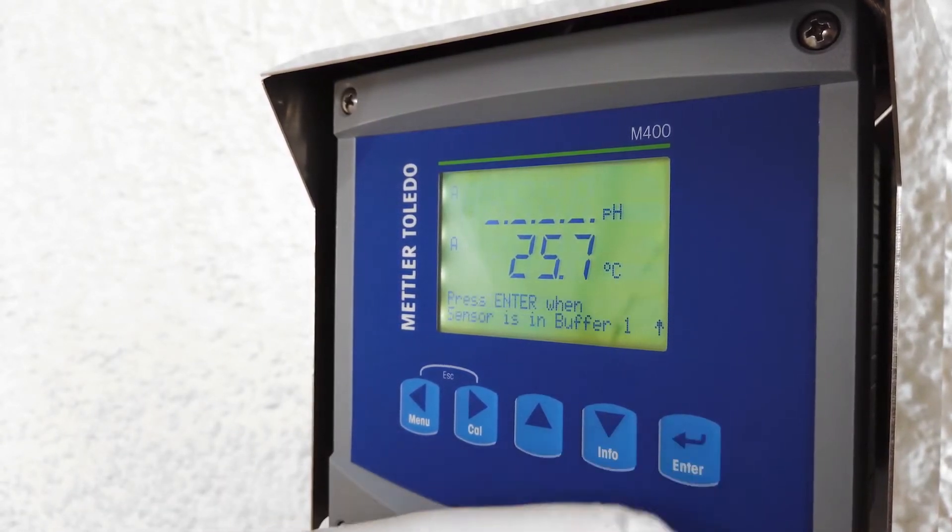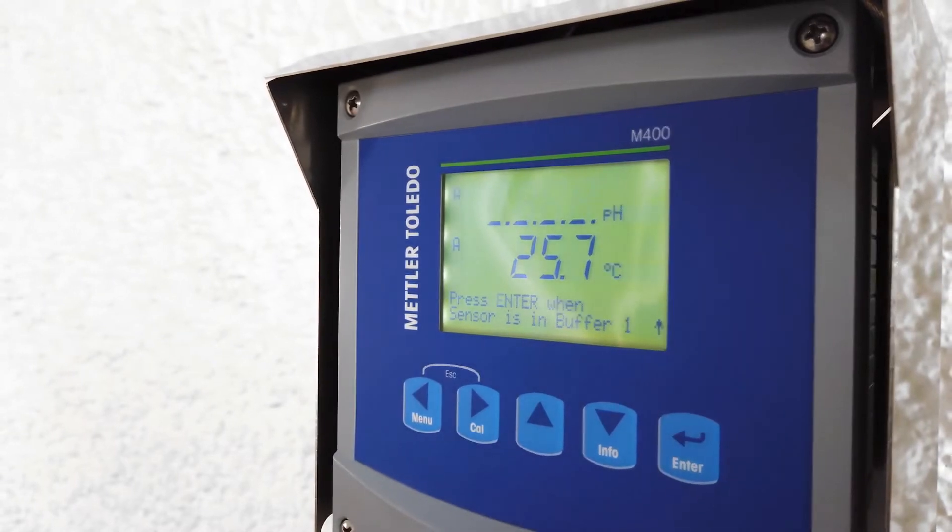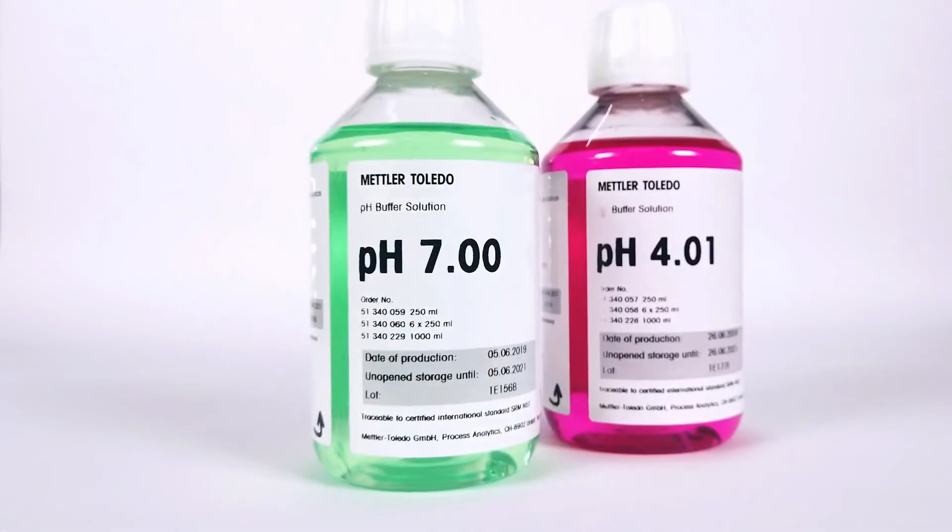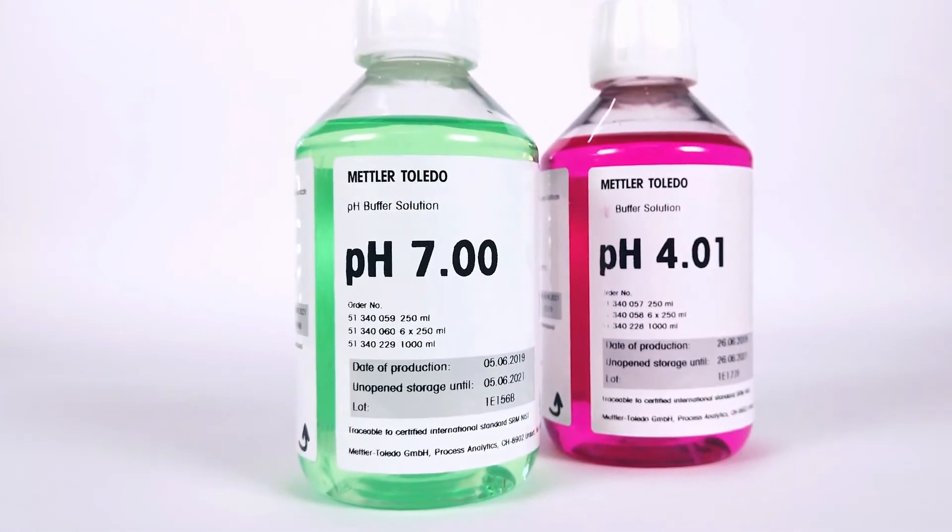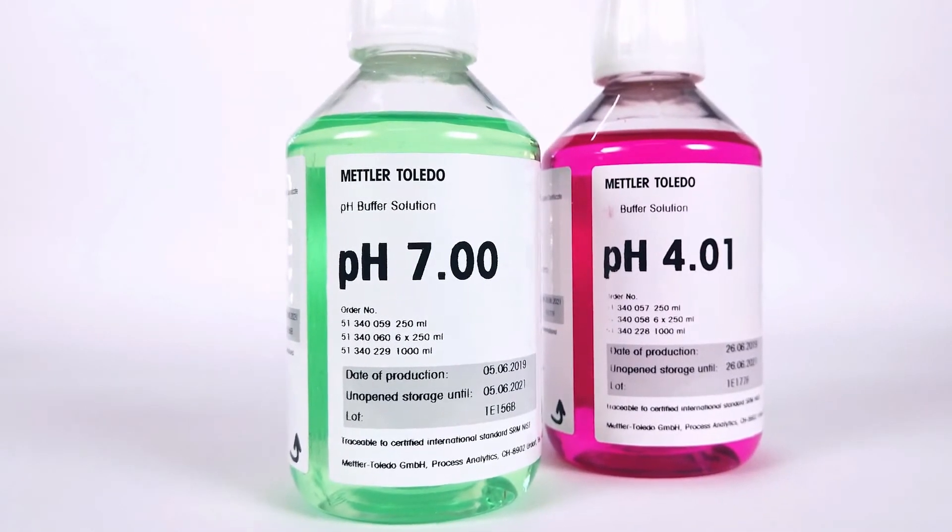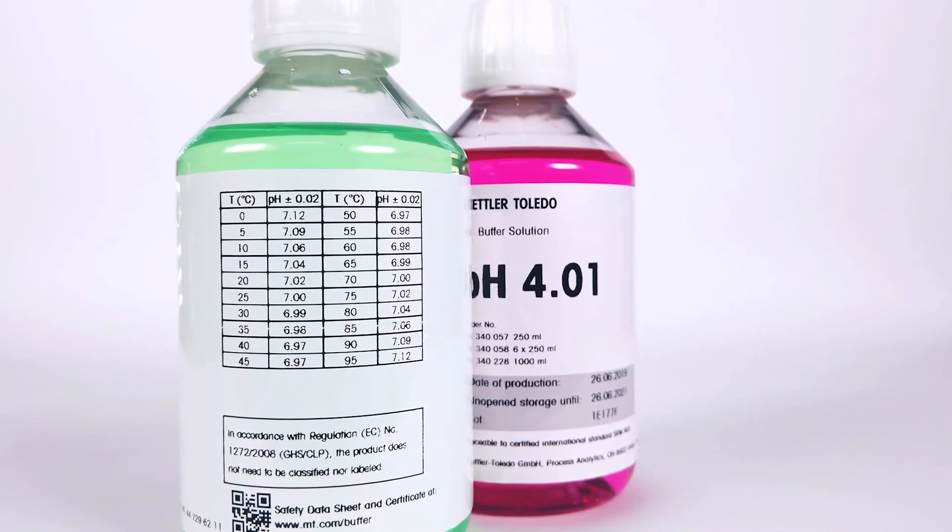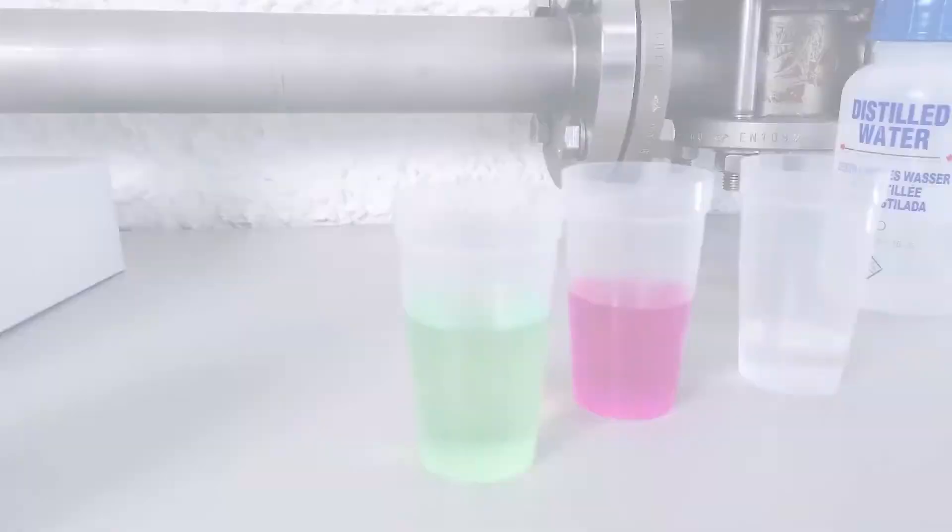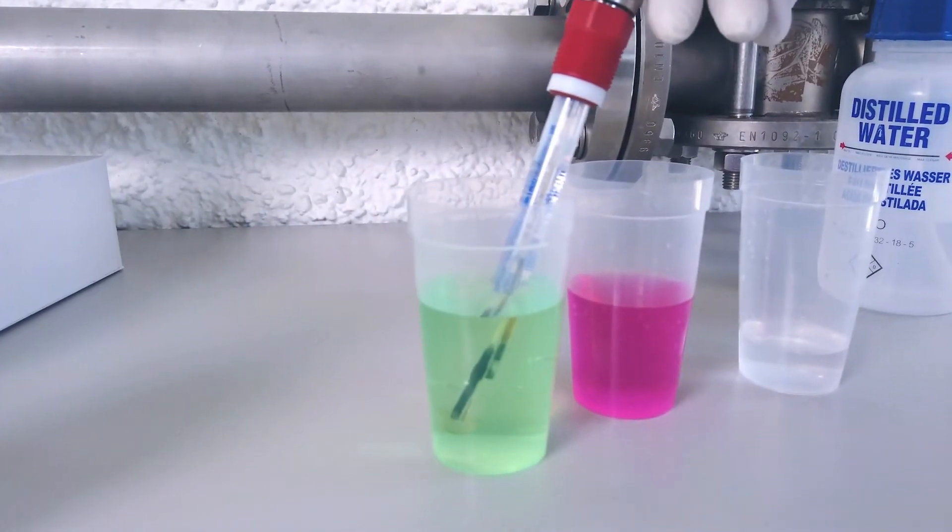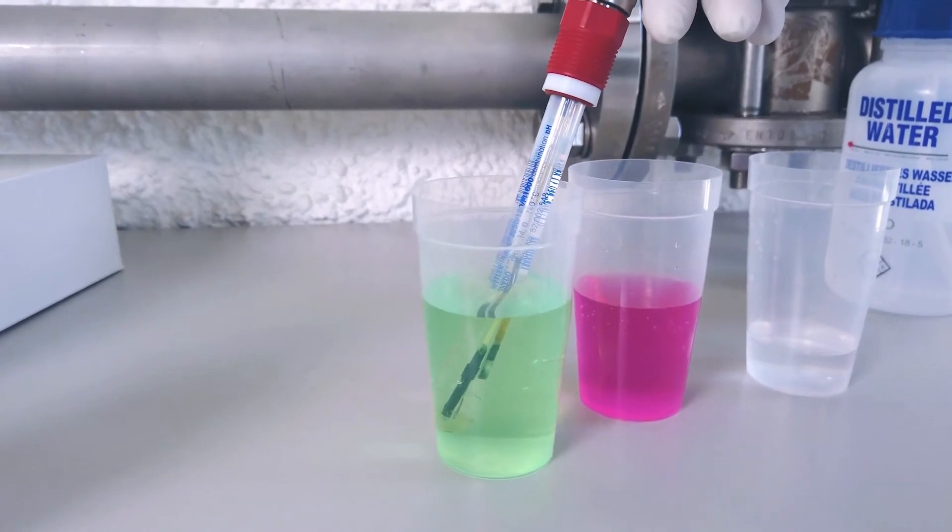The transmitter display indicates that the sensor should be put in the first buffer. Mettler Toledo transmitters can automatically detect buffers as they have a Mettler Toledo buffer table preset on them. Use pH 7 or pH 4 first, the transmitter will automatically detect which one it is. In this case, we're using pH 7 buffer first.